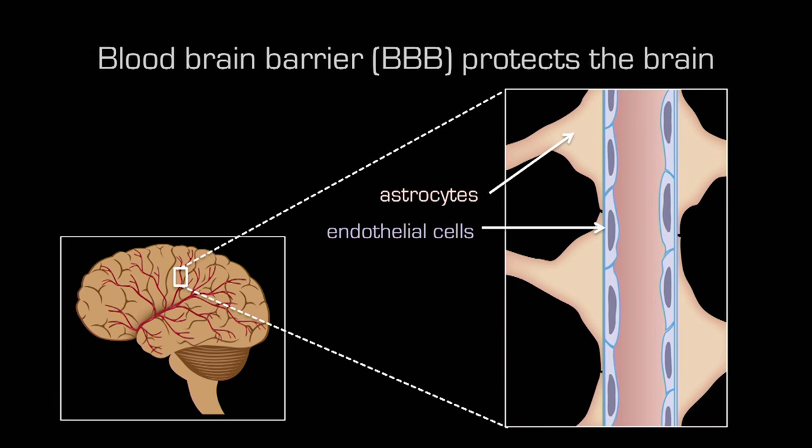So this is our Jello fluidics, which is analogous to our microfluidics, but it's a lot easier to see than just looking at this microfluidic chip up here. But how do we bring this back into the iChip, the human investigational platform? Well, if you think about it, the blood is flowing through the pipes and the tubes in your body all the time. So let's go ahead and think about putting the blood-brain barrier onto a microfluidic chip.